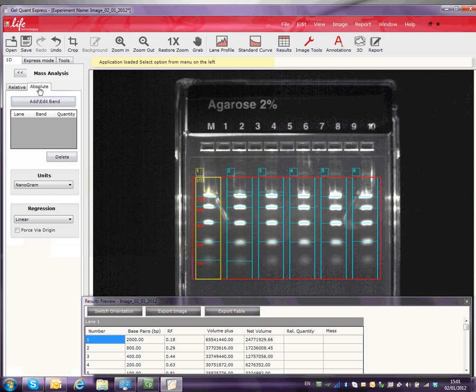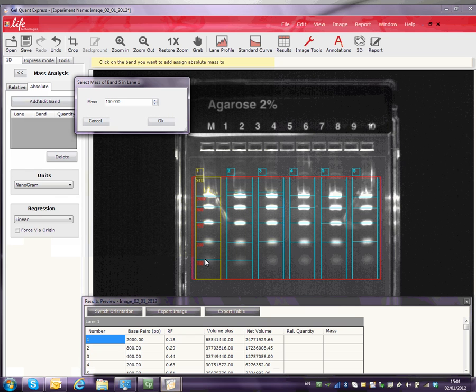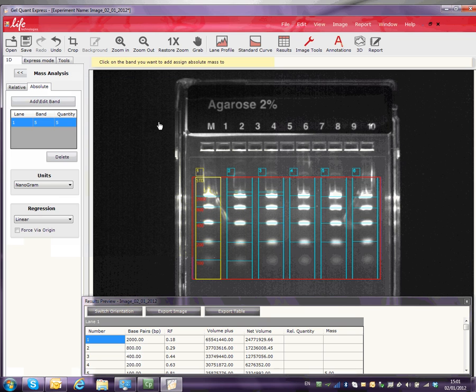Select the Add Edit button and move the cursor to select a band on the gel. A dialog box opens. Type in the appropriate mass. Repeat until all bands are added.